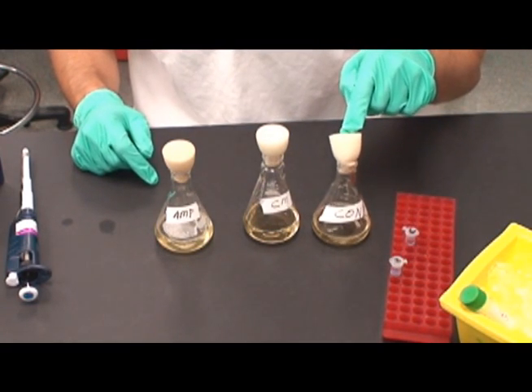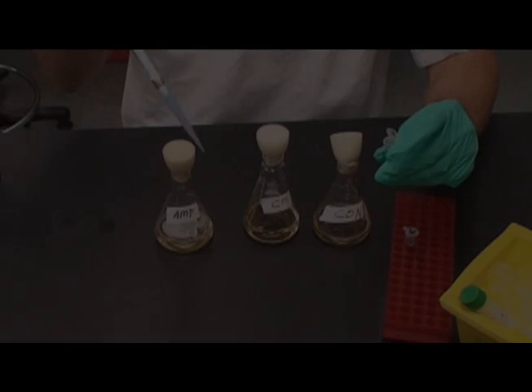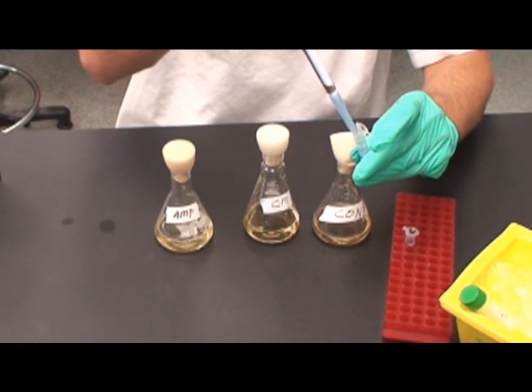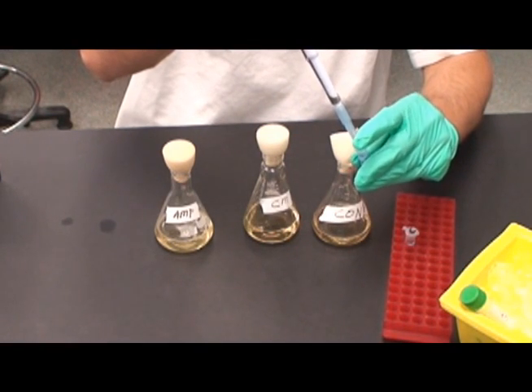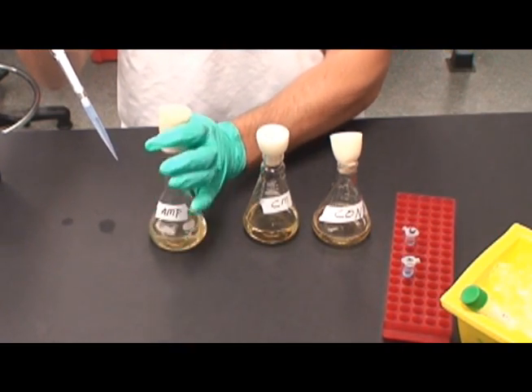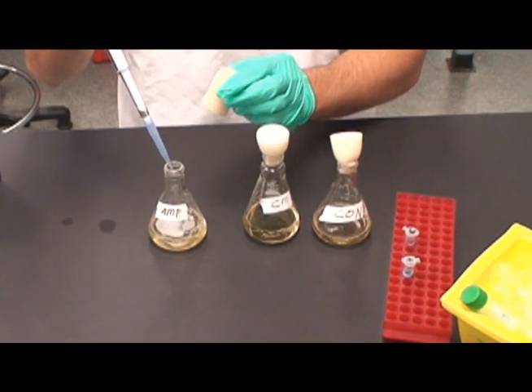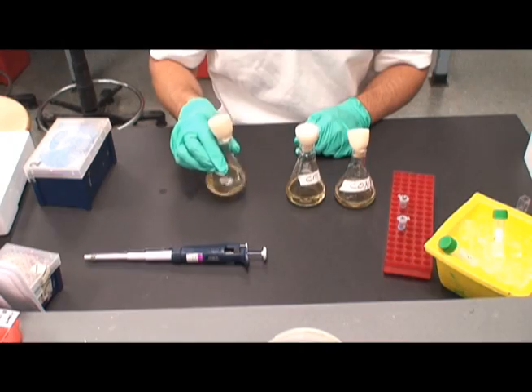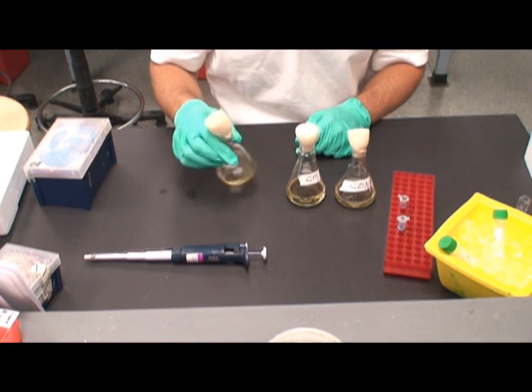Water will be added to the control flask to keep the volume the same. As shown here, 1 milliliter of ampicillin is aseptically added to the amp flask and 1 milliliter of chloramphenicol is added to the CM flask. The flasks are swirled to mix and then returned to the shaker.